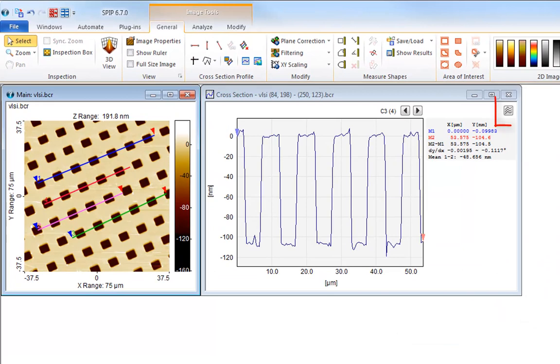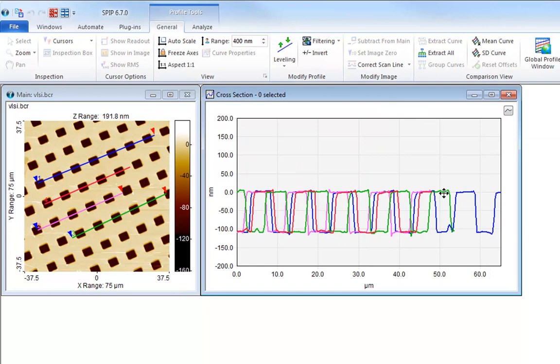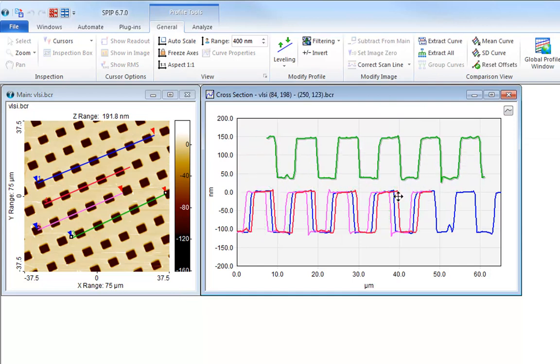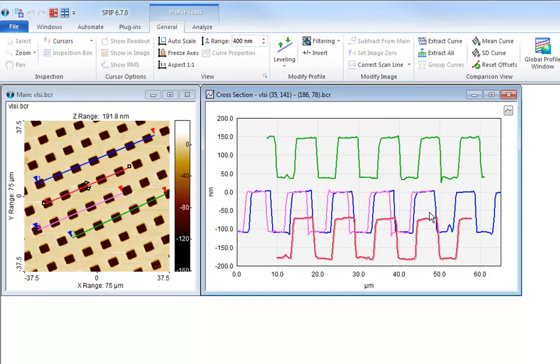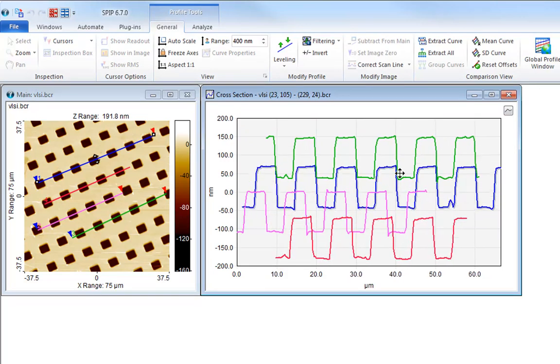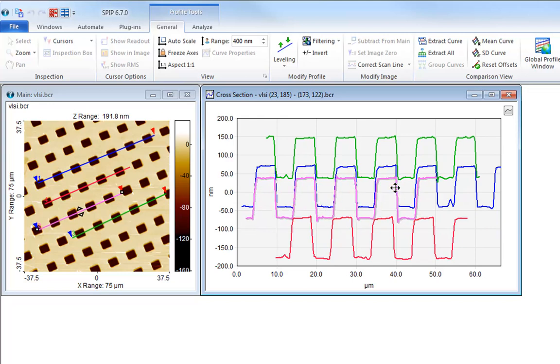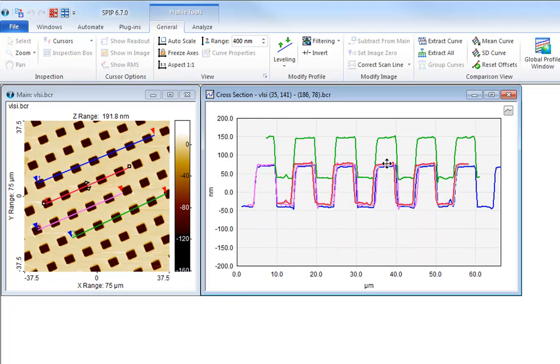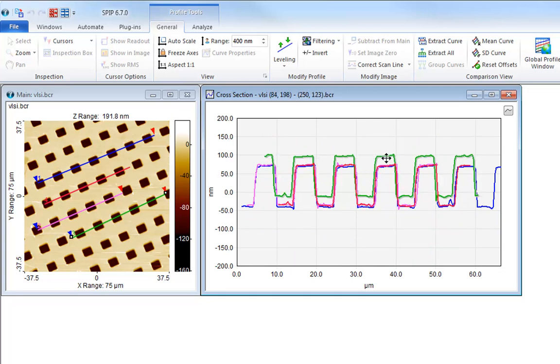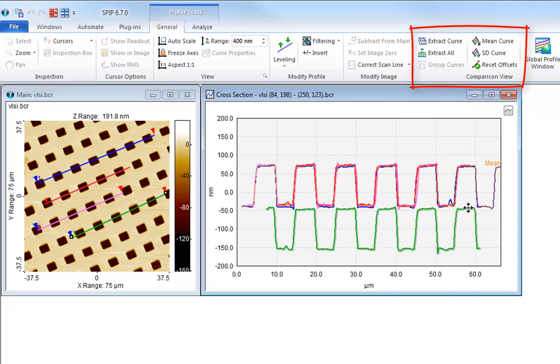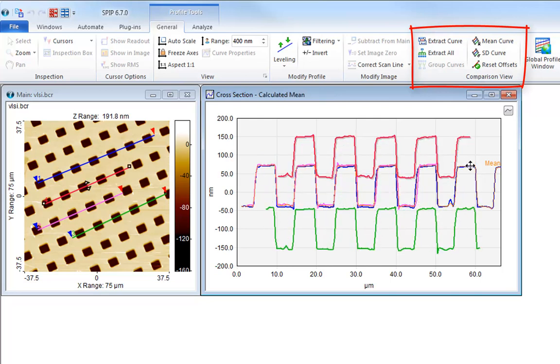Click here to toggle to comparison view. In comparison view, you can compare all the profiles. You can even move profiles interactively, which makes it easy to compare features. In addition, you can average the shown profiles. The mean curve or any curve can be extracted to a new window for further analysis.